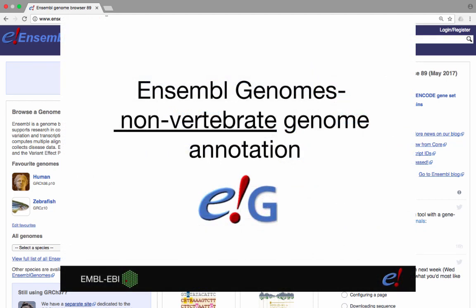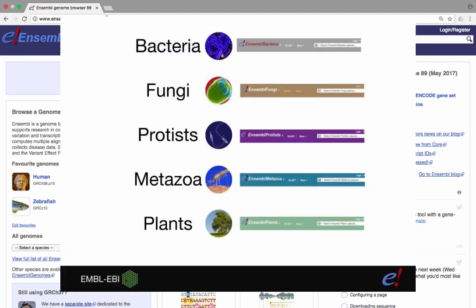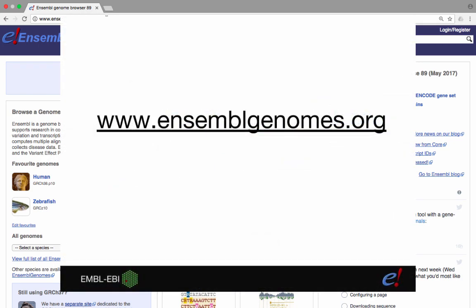While Ensembl is focused on chordate species, Ensembl Genomes is a sister project that extends Ensembl across the taxonomic space and is dedicated to non-chordates, namely bacteria, fungi, protists, non-vertebrate metazoans and plants. You can find the Ensembl Genomes project pages at www.ensemblgenomes.org.